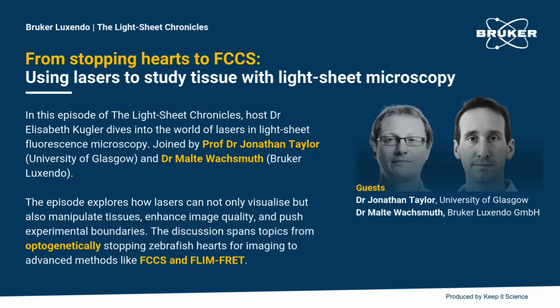And so far, I only mentioned that you can do this on a confocal system, but the big plus of light sheet microscopy is that you don't have a single confocal volume, but you have a two-dimensional array of confocal volumes. So when you can do this in an imaging way, meaning on every single voxel of your camera array, then you can also turn this into an imaging method.